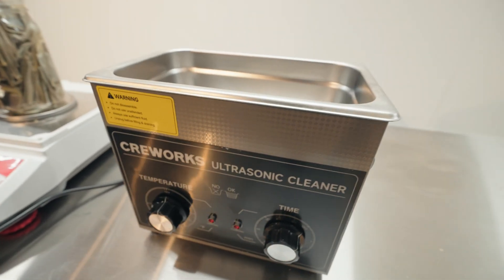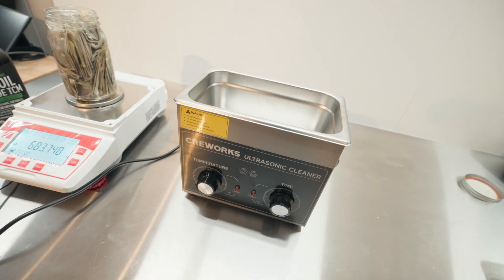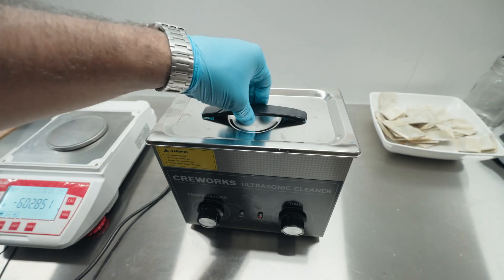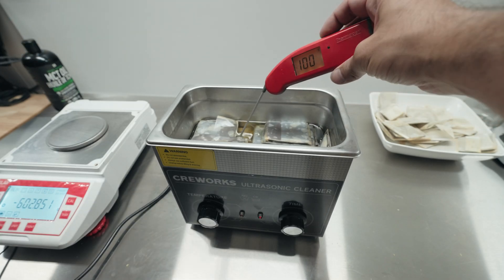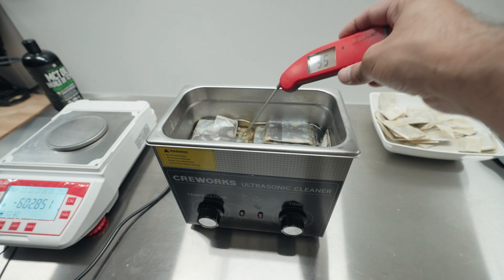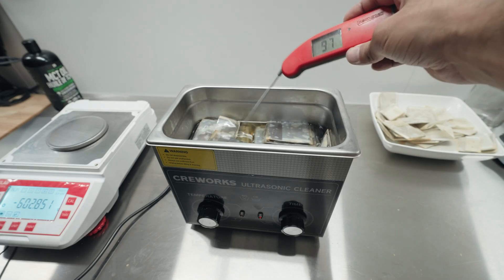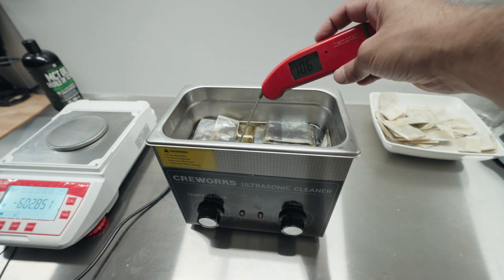We're going to sonicate them first, then do a 30-day soak, and send off samples of both to see if there are any differences. After about one hour — two 30-minute cycles — we noticed it got up to around 106 Fahrenheit as the highest temp we saw. That's without adding any heat ourselves; it's just the heat from the sonication.